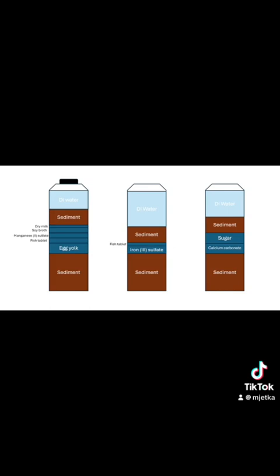The purpose of combining multiple combinations of mud, water, and various materials is to determine how those nutrients affected the gradient of the column. For the first column, the cap was placed on top and closed to ensure no excess oxygen could enter the system. This allowed for a control bottle that only contained what was placed inside it. The other bottles were left open to allow for oxygen to make it into the column.